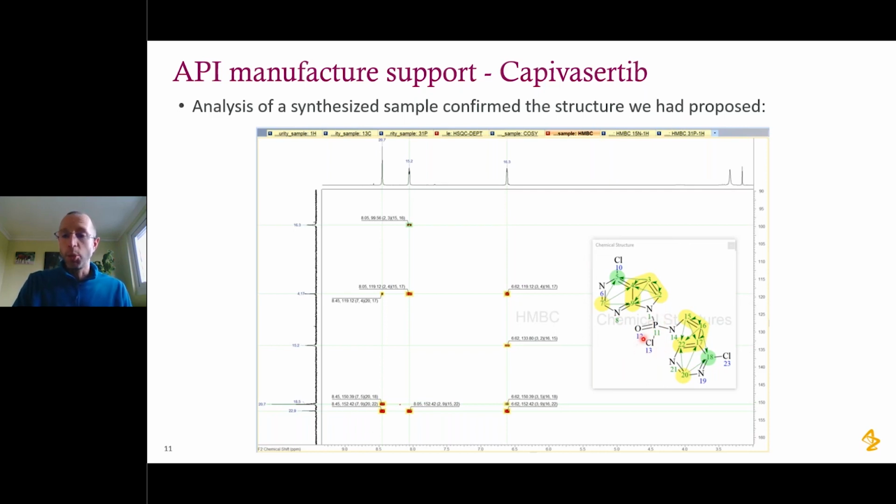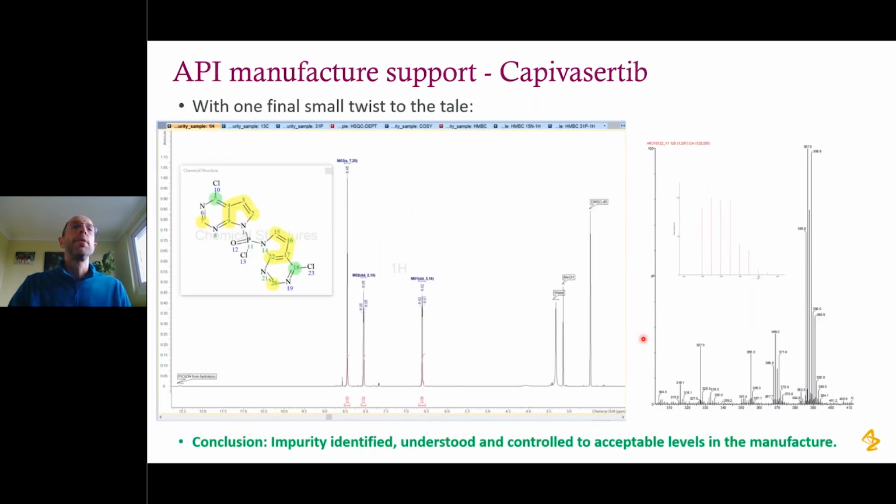There were two ways to approach this. I was happy fairly quickly, actually, to determine that it was a trichloro compound. I was given a nice dry sample and I used anhydrous solvent to do the analysis. You can see here that there is only a small signal annotated that corresponds to the OH, the POH compound. And I was happy to confirm that the bulk material was trichloro, now that we were observing it in a non-perturbed state.